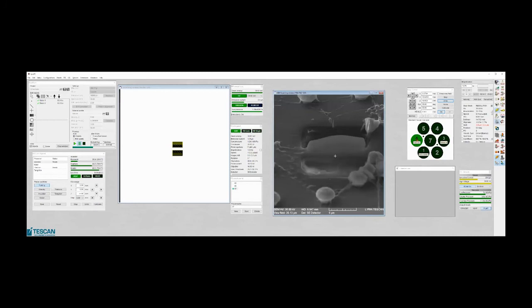So here we lost material contrast because we have now this protective layer here. You can see slightly the difference somewhere here. But we lost that material contrast because of redeposition. For sure, we have a milling effect. We mill material away, but this material is not running totally out of it. Some of it is redeposited back. So we lost material contrast here. So we will polish it.